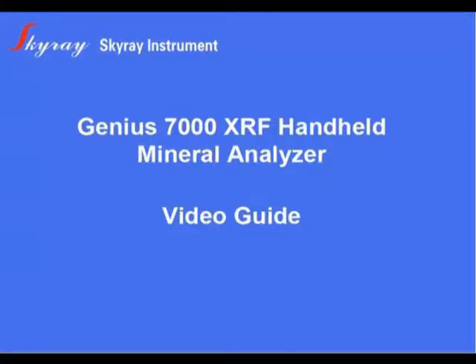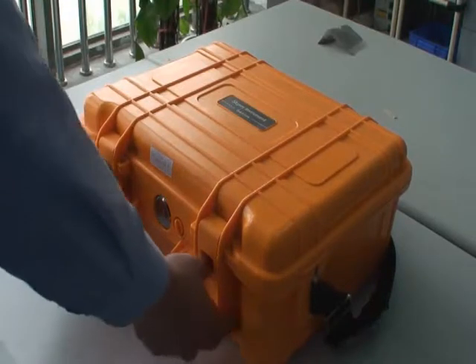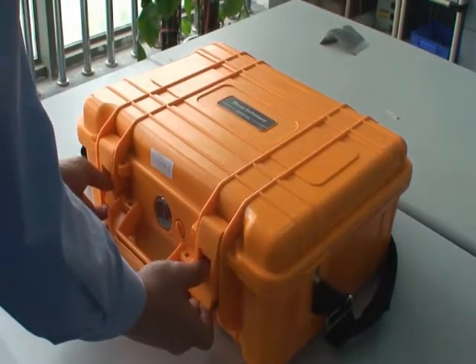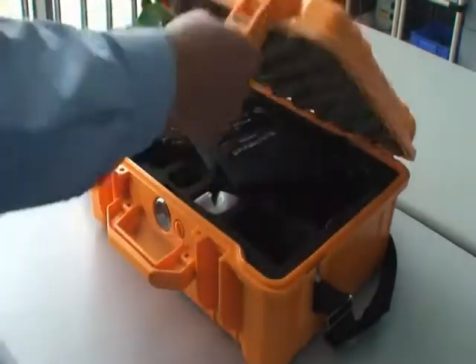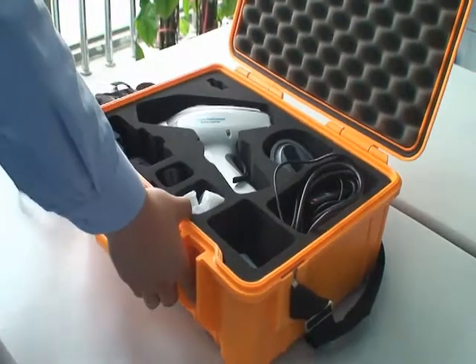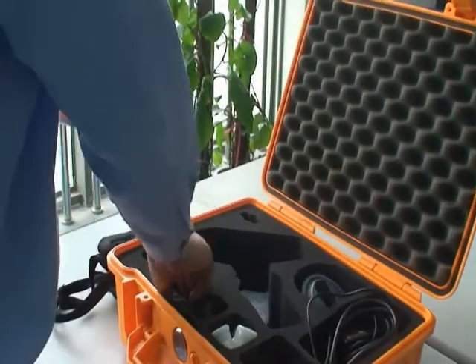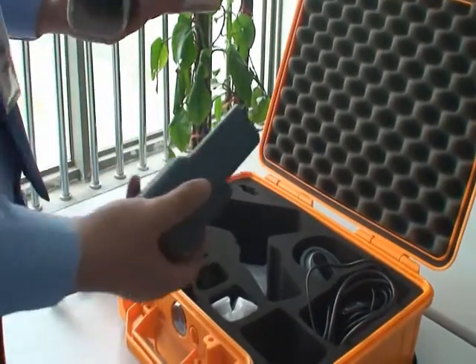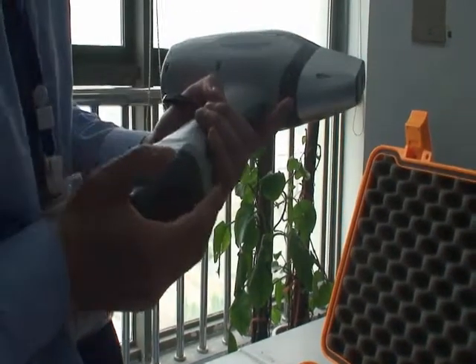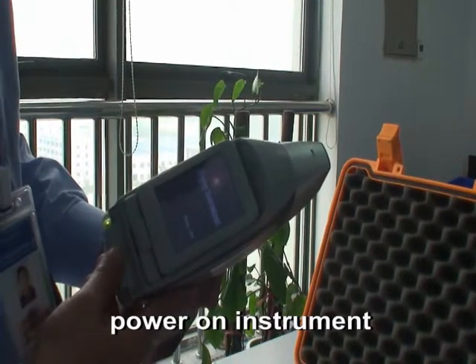Welcome to the World Genius 7000 XRF Handheld Mineral Ore Analyzer Video Guide. Press both buttons to open the suitcase. Take out the instrument and battery. Insert the battery into the instrument. Insert the SD card in the card slot.